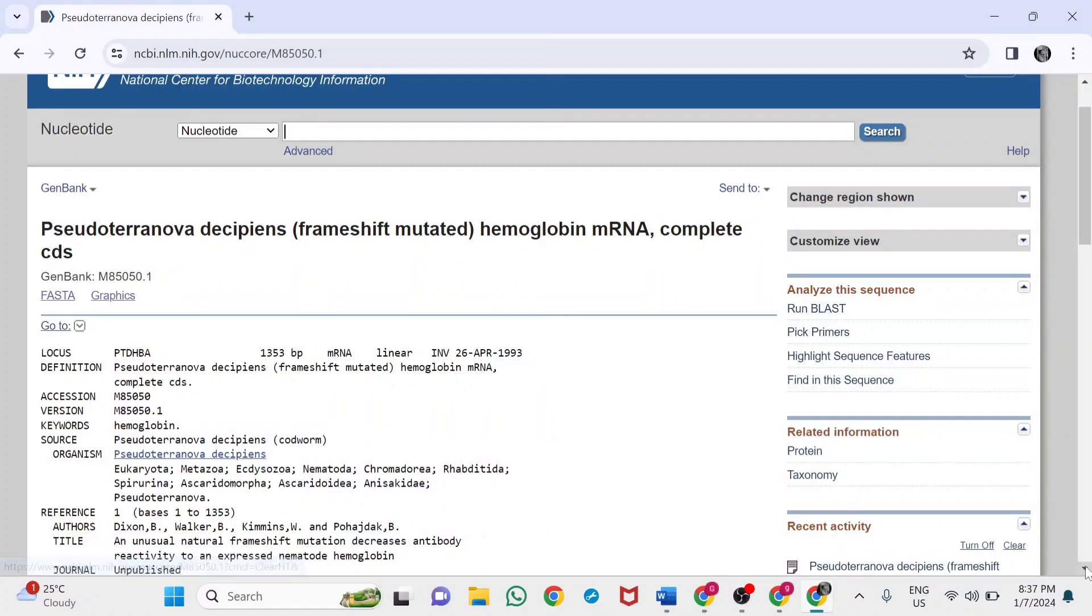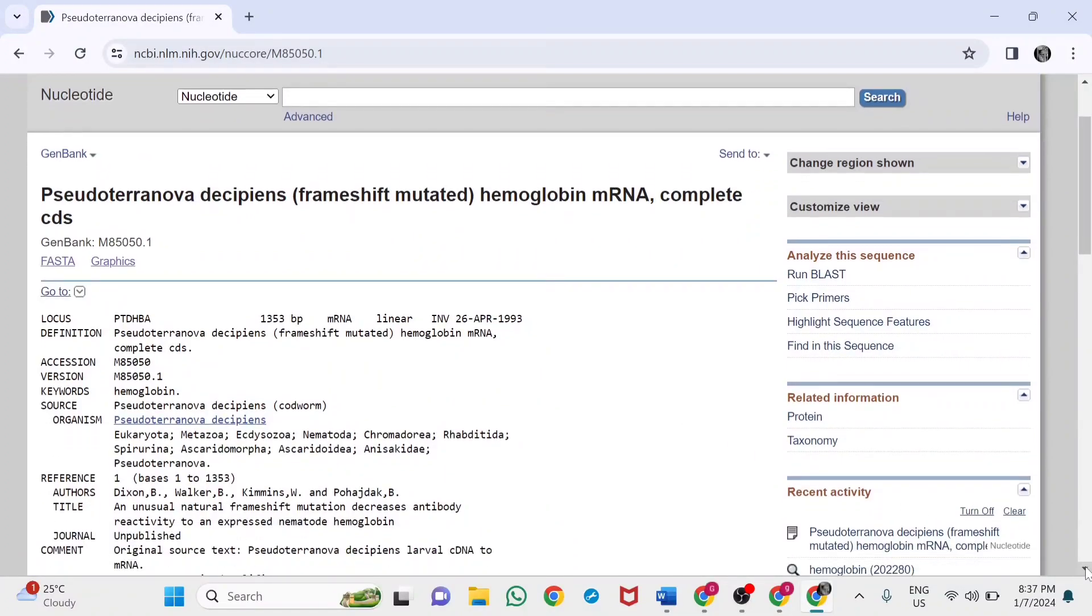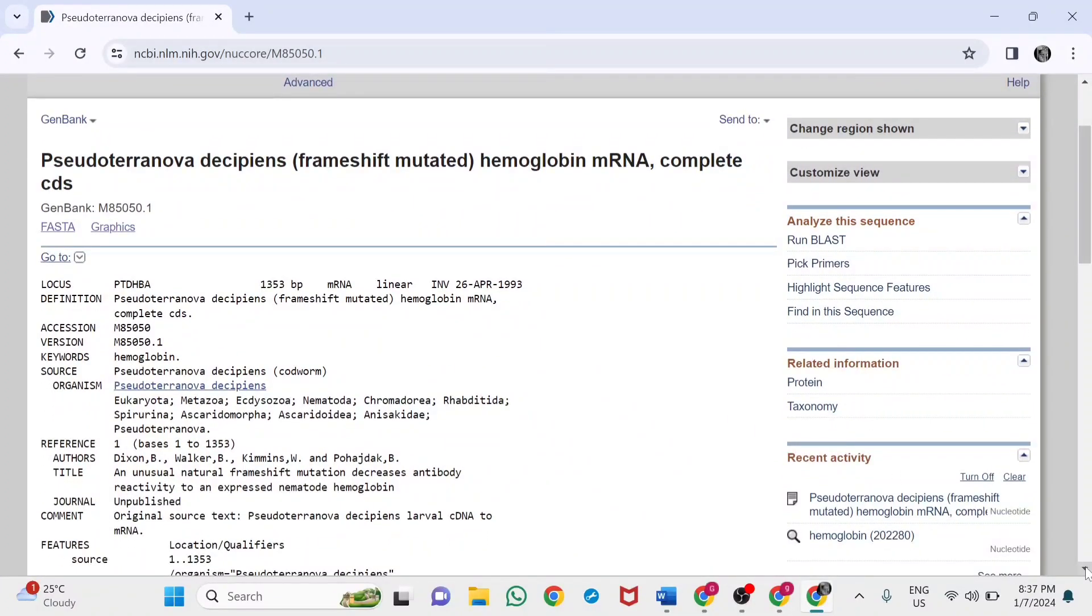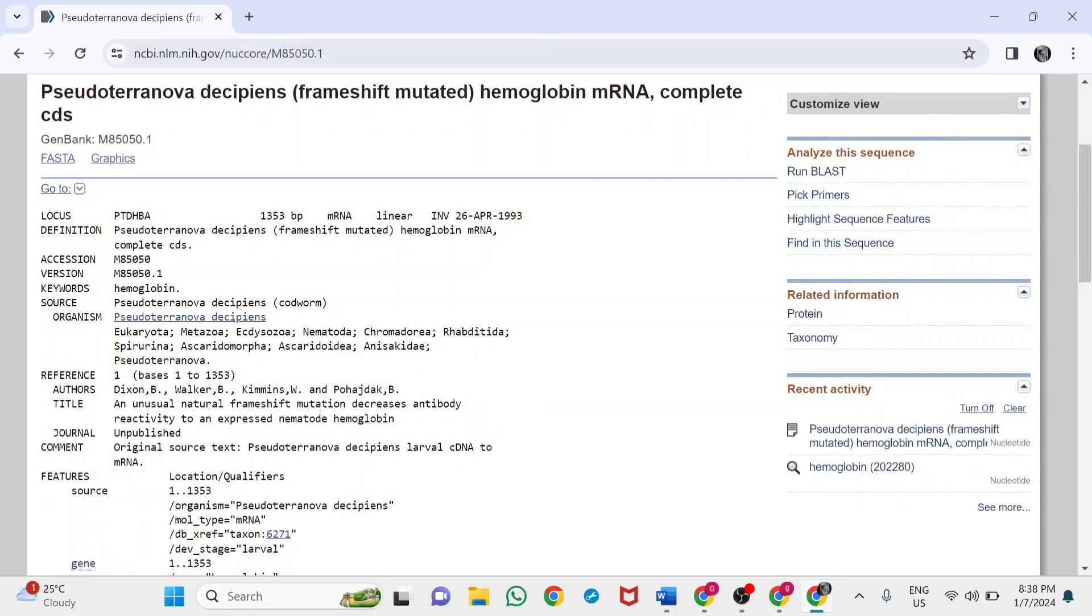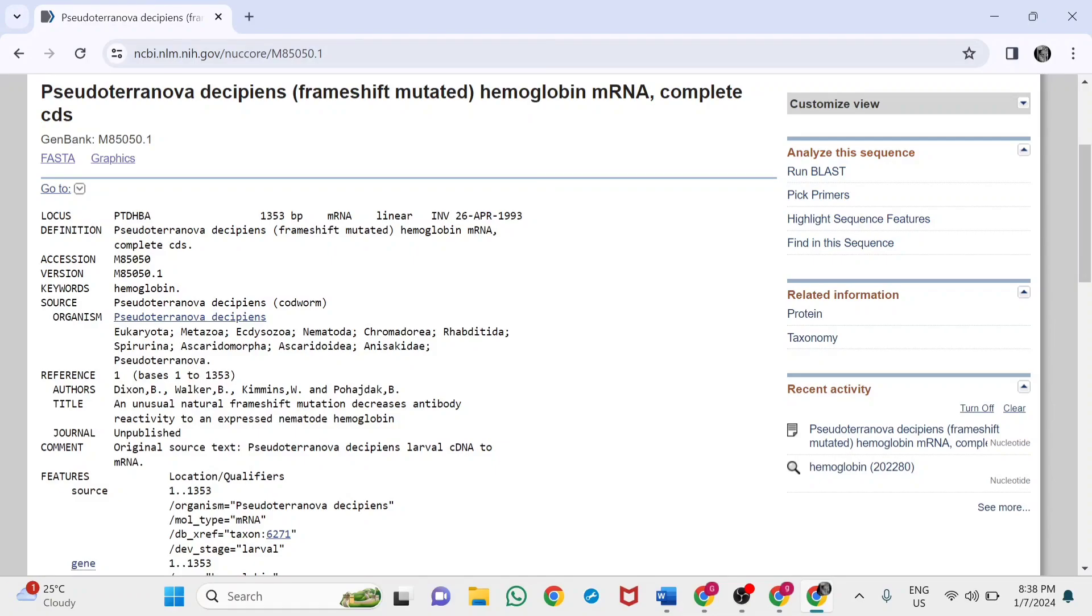It represents the phylogenetic classification. It shows eukaryotes, metazoa, then the kingdom, phylum, class, and order. These details are mentioned here. This is the reference section.